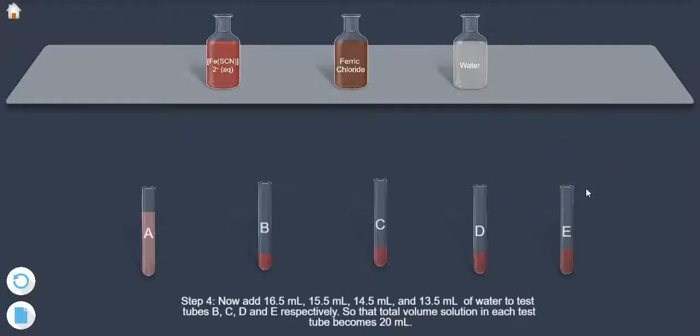Now add 16.5 ml, 15.5 ml, 14.5 ml and 13.5 ml of water to test tubes B, C, D and E respectively, so that total volume solution in each test tube becomes 20 ml.